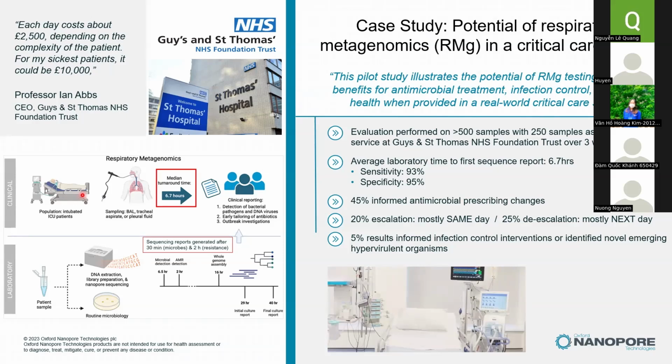Can you repeat your question again? What I get is how many samples can be run in one flow cell, right? For which application? For whole genome sequencing, like to close a genome. Okay. For whole genome sequencing of bacterial isolates, the NOMIS protocol that we have optimized end to end allows up to 24 samples to be multiplexed in one flow cell.